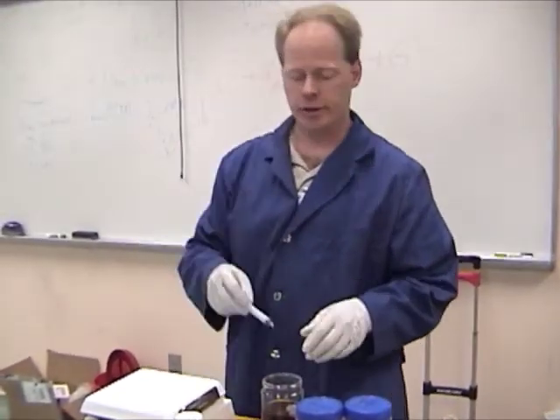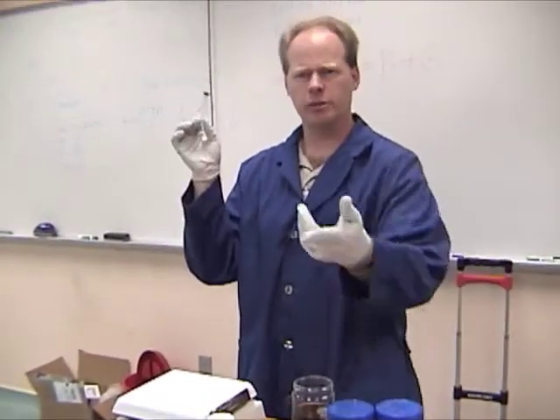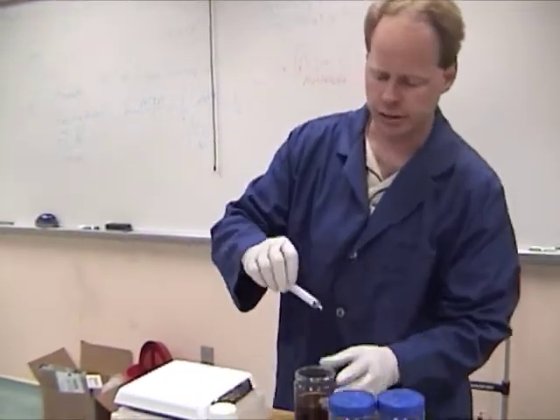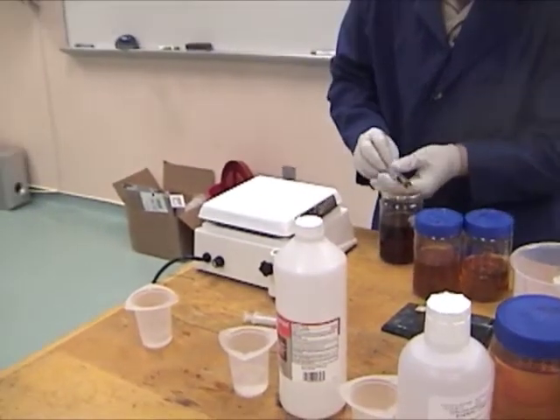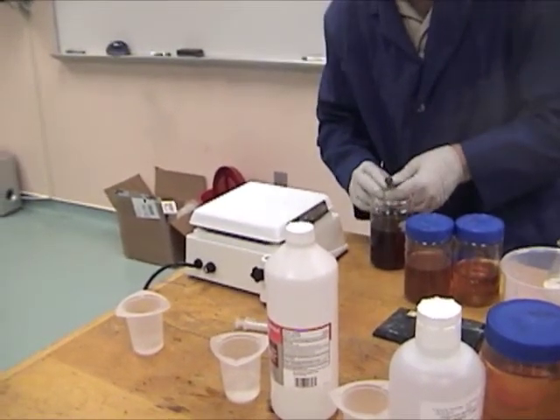Use a clean syringe. You can clean syringes out too with isopropyl alcohol because it's a clean solution. Again, if you want to keep them clean, I'm just sucking up 1 milliliter of oil.